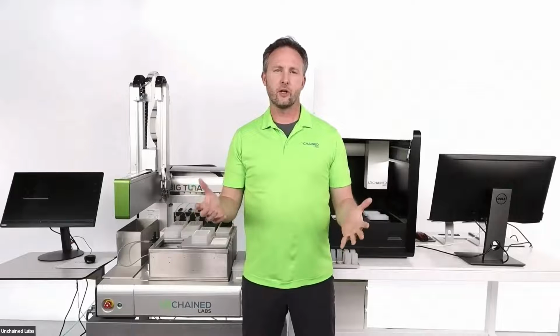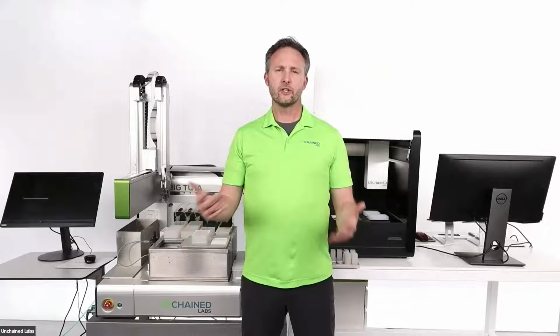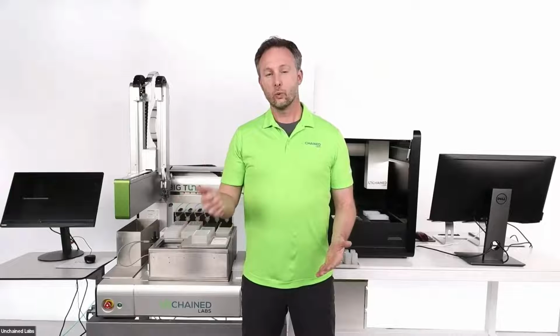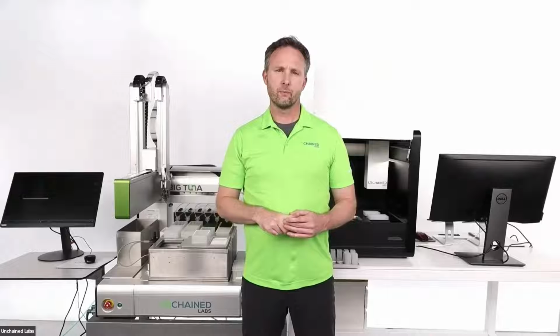Fantastic. So hi, everyone. Glad you could join us today. If you're here, most likely you're dealing with some biologics or gene therapy biomolecule and probably understand the importance of buffer exchange and sample concentration for them. Each of them can have different challenges. If you're dealing with proteins, for instance monoclonal antibodies, perhaps you need to do buffer exchange for very many samples at one time. Perhaps you're doing discovery or some sort of formulation development. And if you're working with a vector such as AAV, a viral vector, what's really critical is needing to concentrate that to your specific target value.